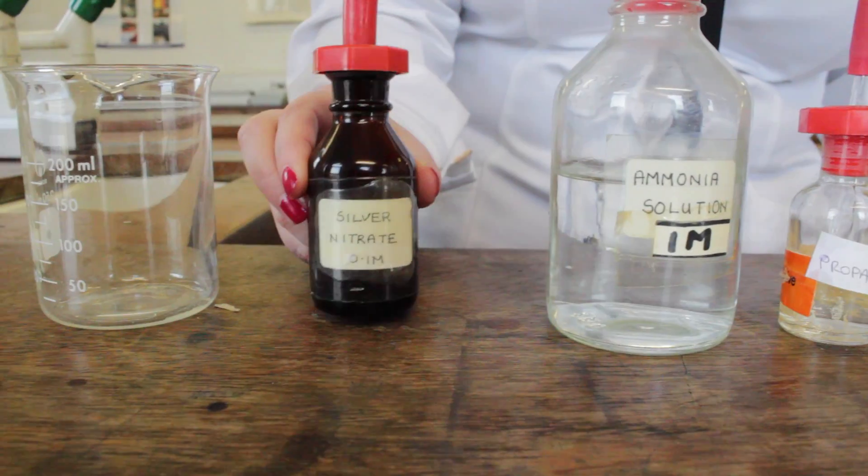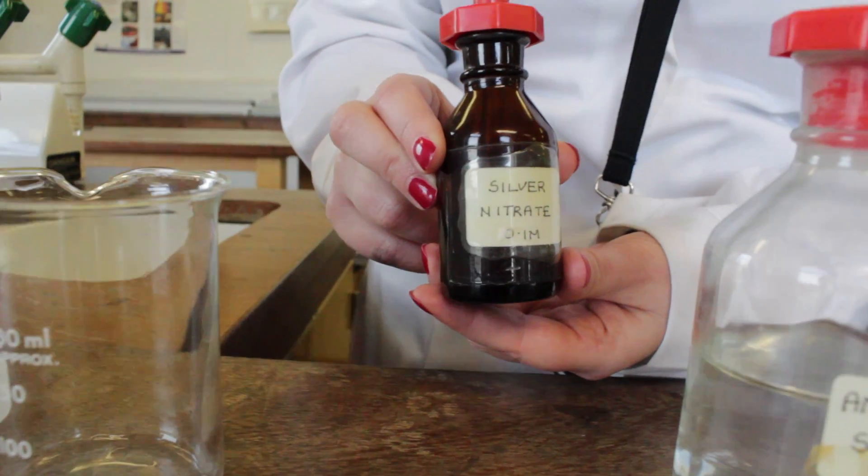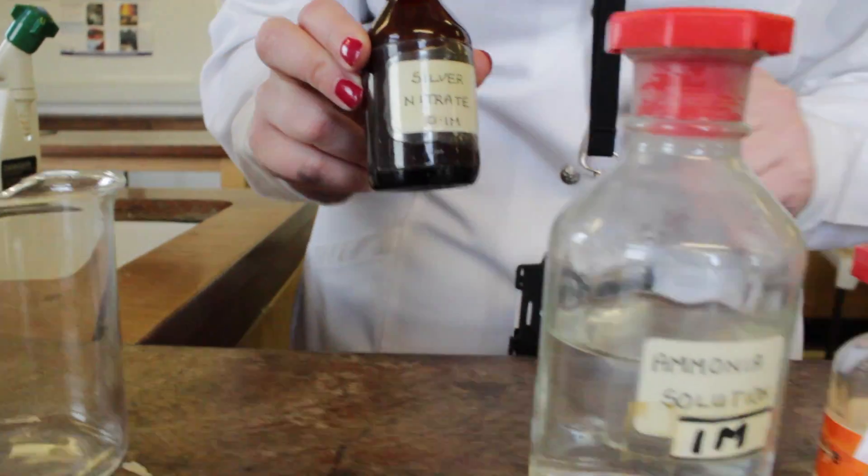We start by adding about 2 cm³ of silver nitrate solution to our test tube.